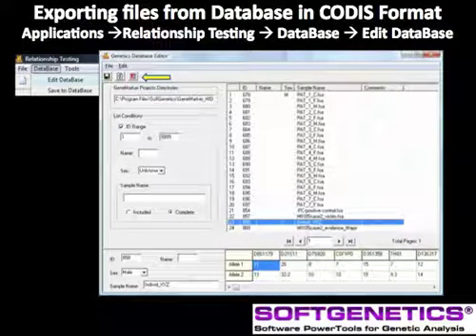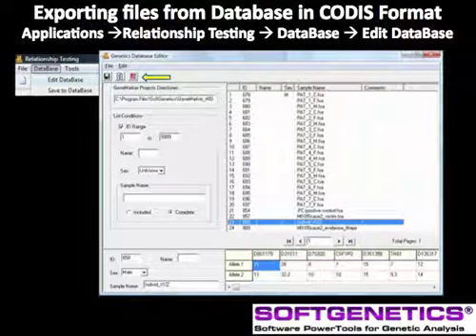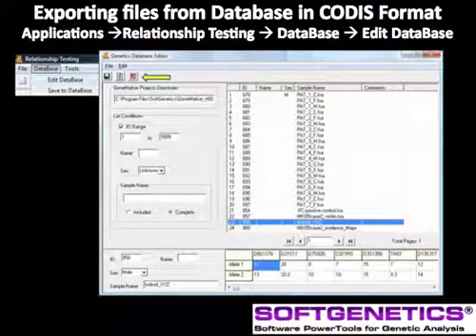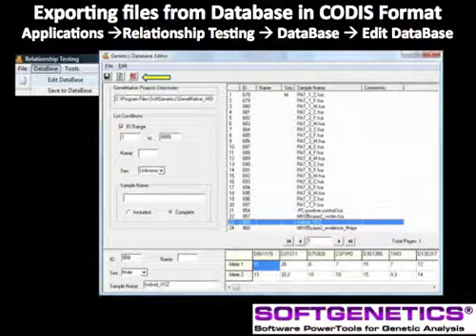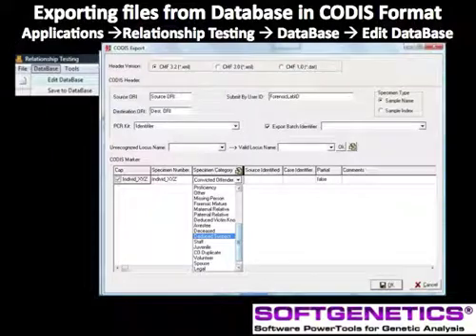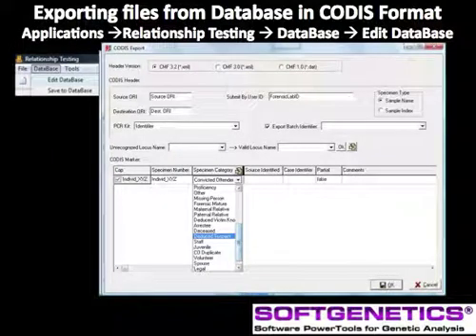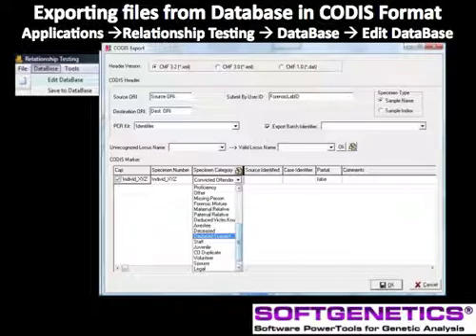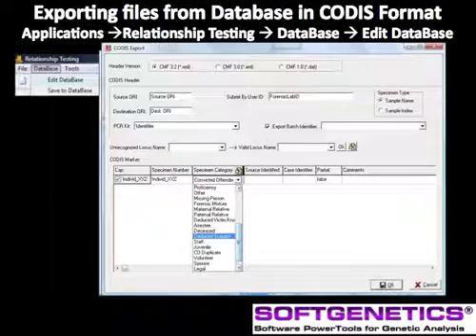In the Relationship Testing screen, select Database and Edit Database. Select the file and then the CODIS export icon. This easy-to-use interface has fields to record the user ID, source and destination ORI, and saves the files in CODIS-compatible format. Select the PCR kit, the specimen category, and the source identified verification from the drop-down menus, then save with the disk icon at the lower right.